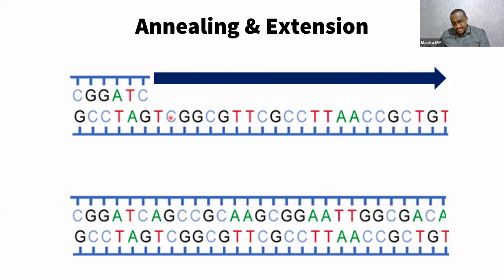If you consider this as the primary strand, then another primer will attach from this side, going this way, from the 5' side in the 3' direction. So the idea here is you have a primer that attaches to the complementary part of a target DNA. And that allows the polymerase to extend the strand so that it can complete making the copy.